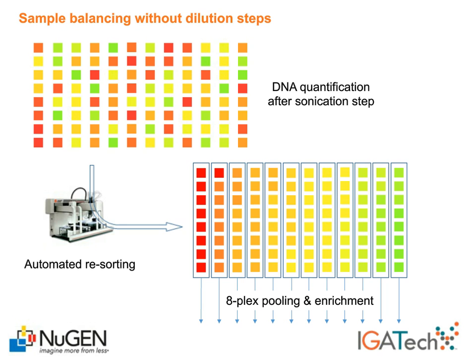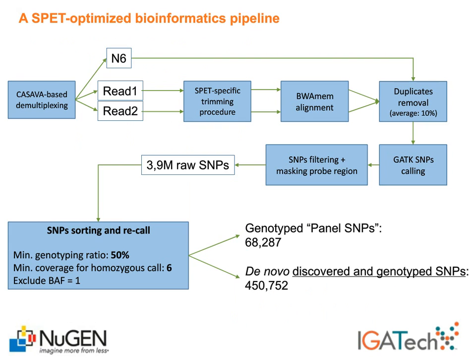We developed a specific pipeline to manipulate this type of libraries, as they require dedicated trimming on the 2 ends, given the presence of linker adapters and so on. And after the removal of duplicates, we experienced a level that was always below the 10% threshold.